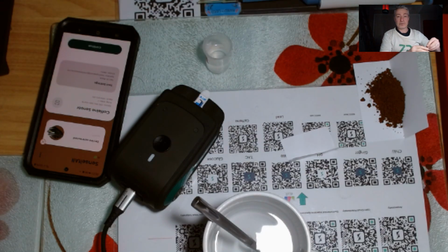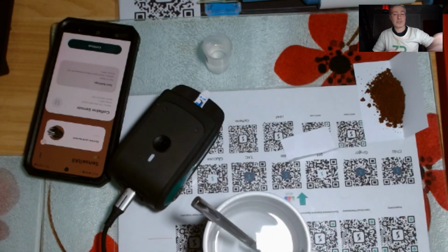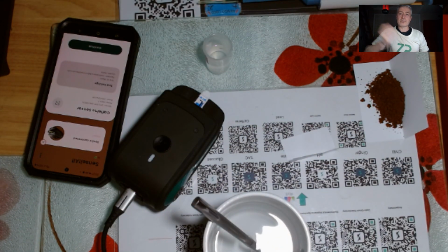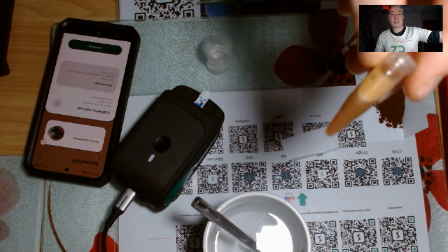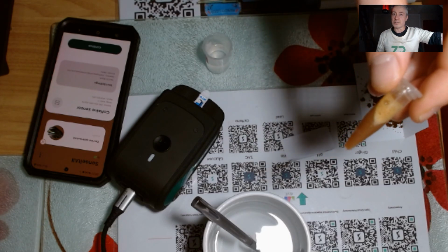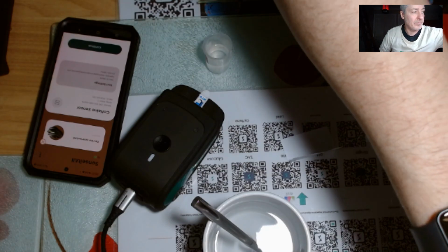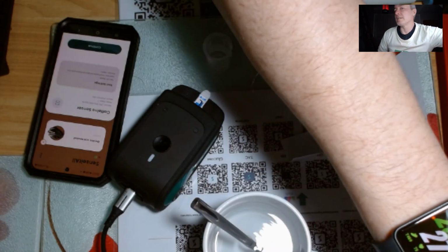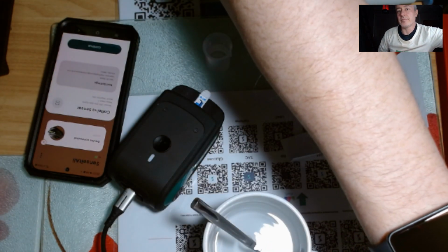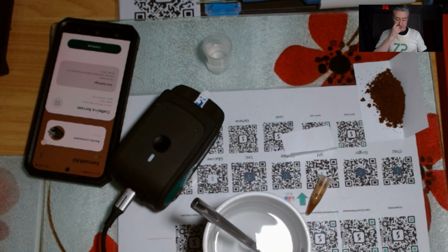Right. Just out of shot, I do have a vortexer, because, as you can see, I've got a lyophilized powder. In fact, because it's a lyophilized powder, I could probably just shake it. I mean, admittedly, I can shake it there. I say a lyophilized powder; I should say it's freeze-dried coffee. It's instant coffee. But let me just vortex it, because that will definitely guarantee the dissolution of that material. Right. So I've done the vortexing.